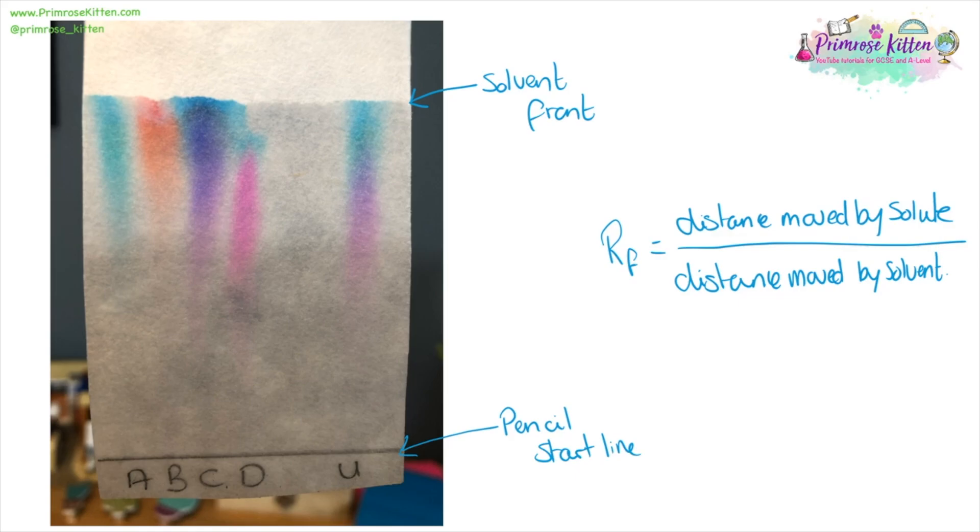Here we have a close-up image of the chromatography we just ran. We can see our four different colour samples look very different to each other, and then we can see our mixed sample looks like it is a combination of two things. We have a spot here which appears to be the same as this here, and then there is another section here which appears to be the same as this.